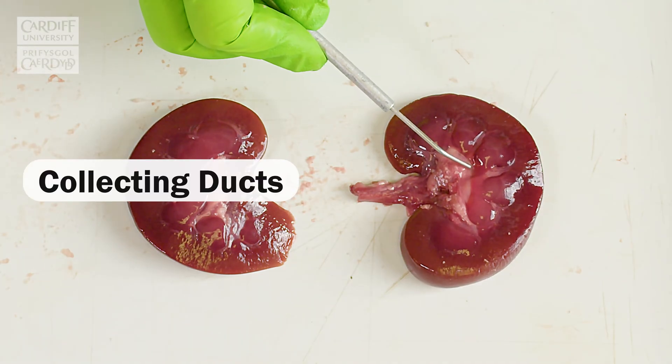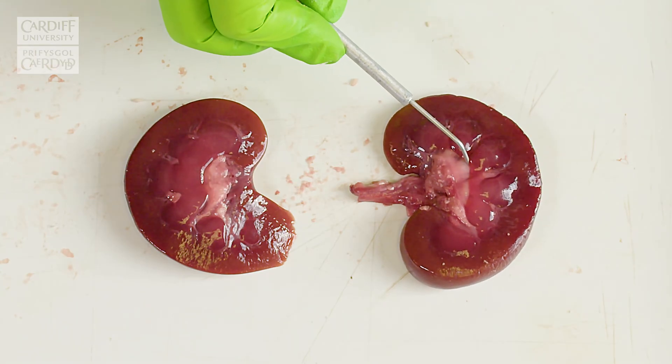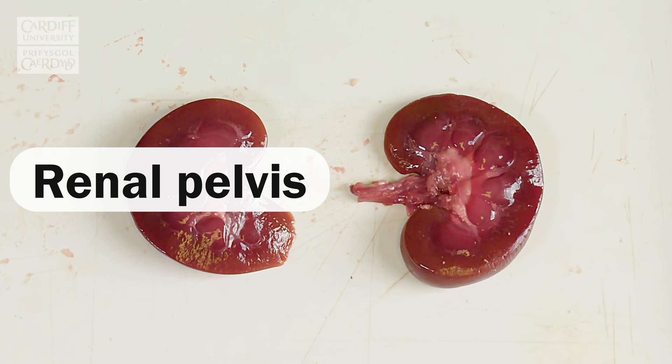And we have collecting ducts at the bottom of the medulla, which then drain into the calyx, which then drain into the renal pelvis and out through the ureters.